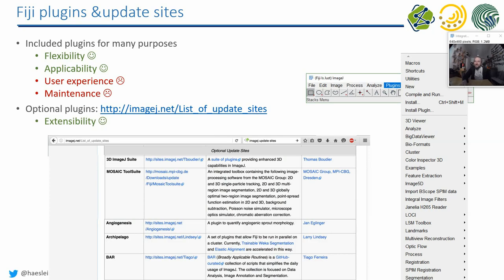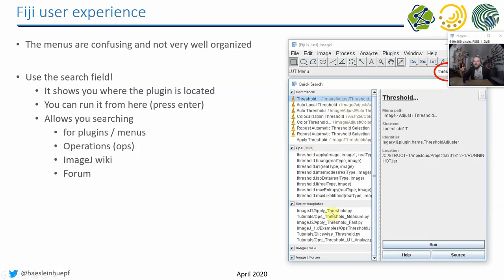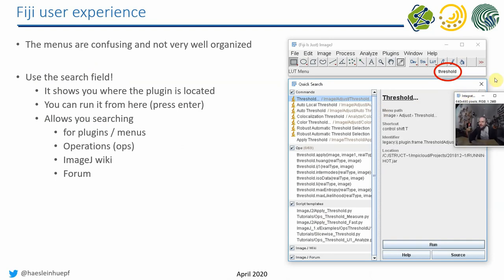Furthermore, Fiji and ImageJ are extensible. There's a website listing additional update sites which bring even more menu entries to your Fiji, making it even more complicated to find what you want. That's why a search field was integrated into the Fiji main window — you can type what you're looking for, such as 'background subtraction' or 'threshold', and find the operation quickly. People who use ImageJ a lot mostly use this search field rather than menus.